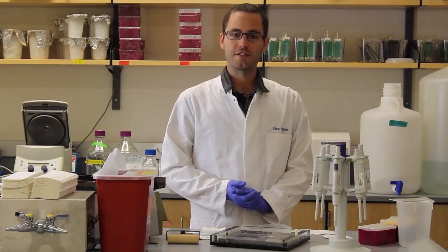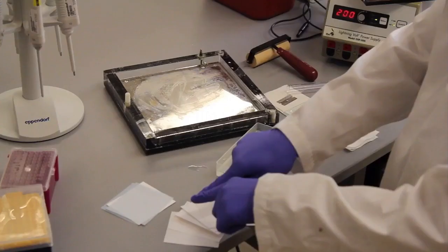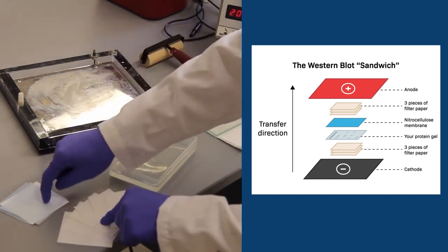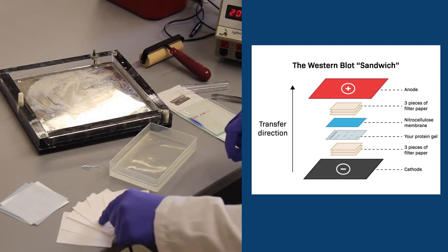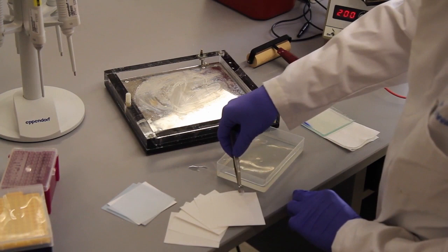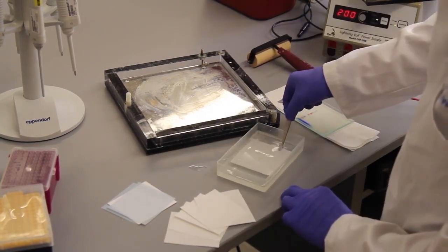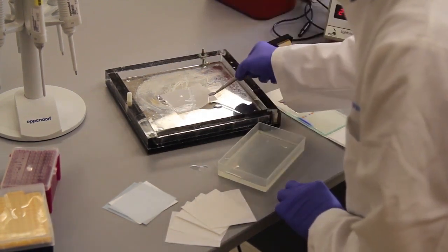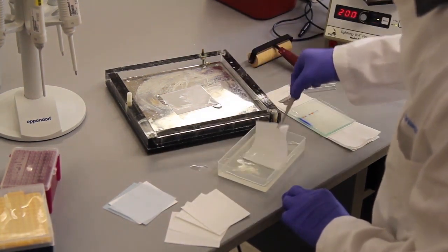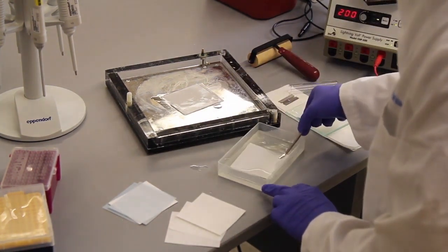To run a Western blot, the first step after running the protein gel is to assemble the Western sandwich. The Western sandwich consists of three sheets of Whatman paper, the gel, a nitrocellulose membrane, and three more pieces of Whatman paper assembled in this transfer chamber. An important thing is to not touch these with your fingers, so I'll use tweezers. I'm pre-soaking everything in transfer buffer first, and that just helps the transfer occur more smoothly later on. So second piece of Whatman paper, and the third piece of Whatman paper.